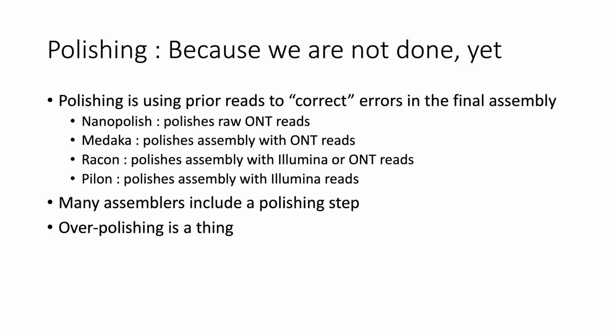My favorite polisher is Pilon, mostly because it uses Illumina reads, which, if you're using just a nanopore-only assembly, haven't been included in any part of that assembly process. So they're kind of an orthogonal sequencing that is generally higher quality that you can use to correct errors.